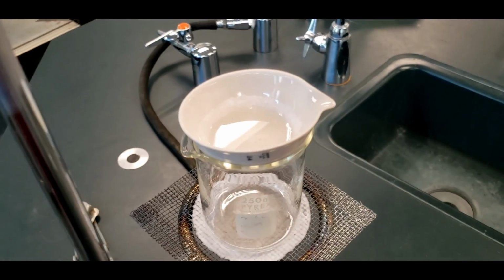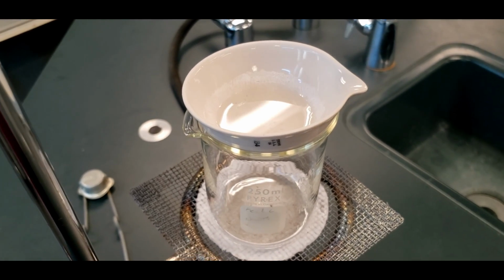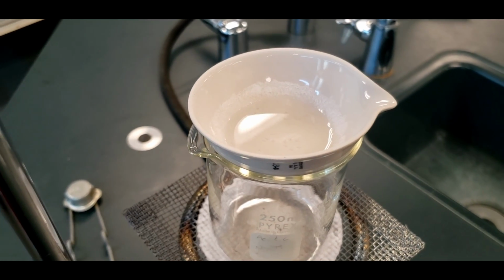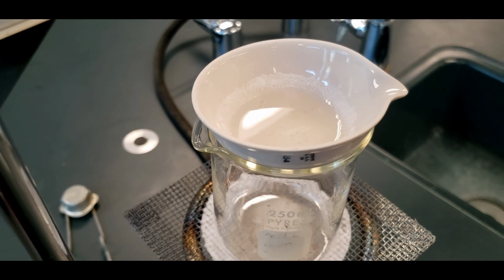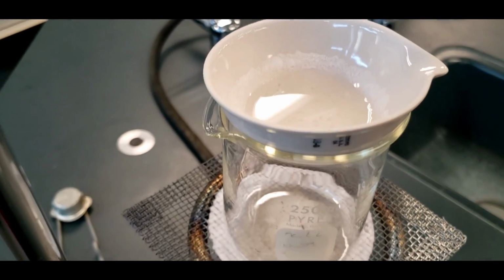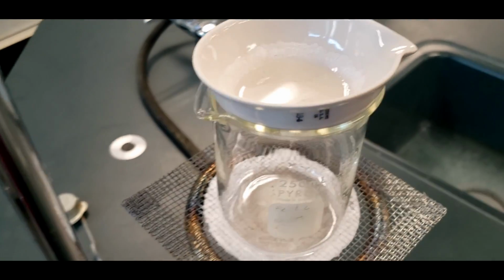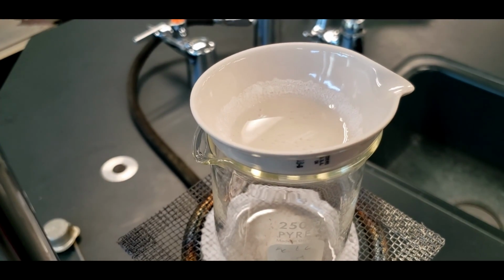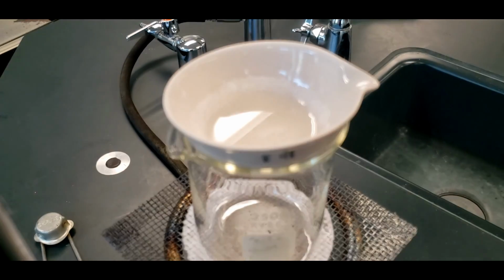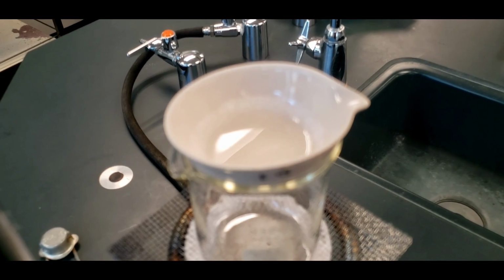Here's the solution after about 20 minutes, and well, maybe closer to half an hour, but you can see the salt is forming on the sides. The solution is steaming, and we're down to maybe 1/4 of what we had. You can see the little bubbles in the bottom. So I'm going to next let it cool a little bit so I can get a hold of it, and then I'm going to remove the beaker and put the evaporating dish on the wire mesh and complete the evaporation that way.